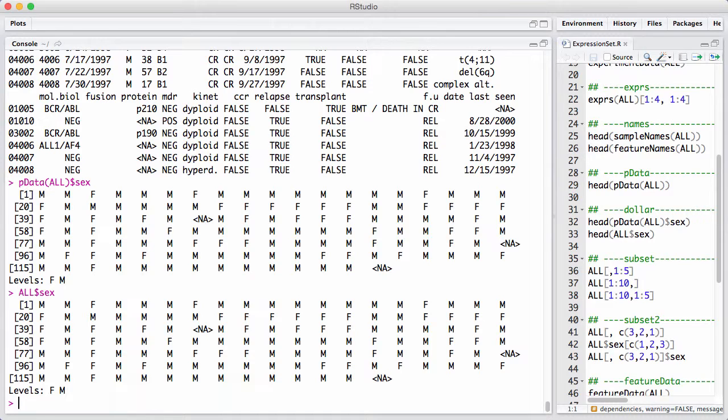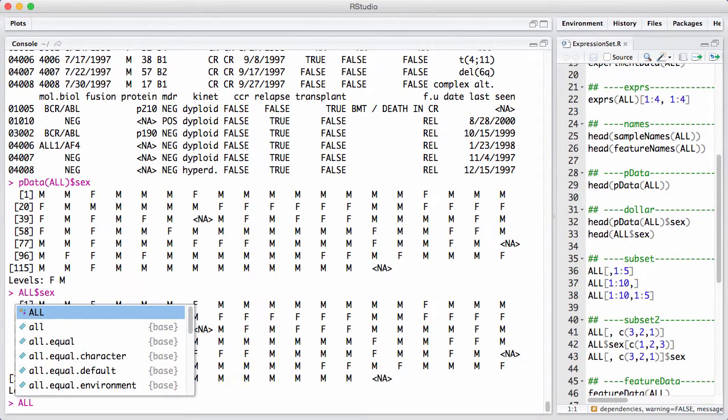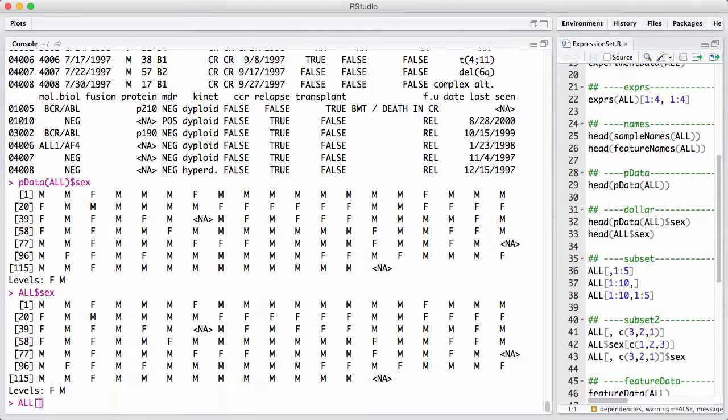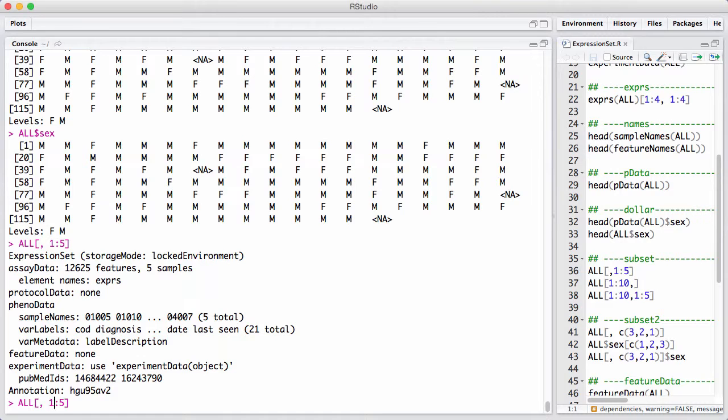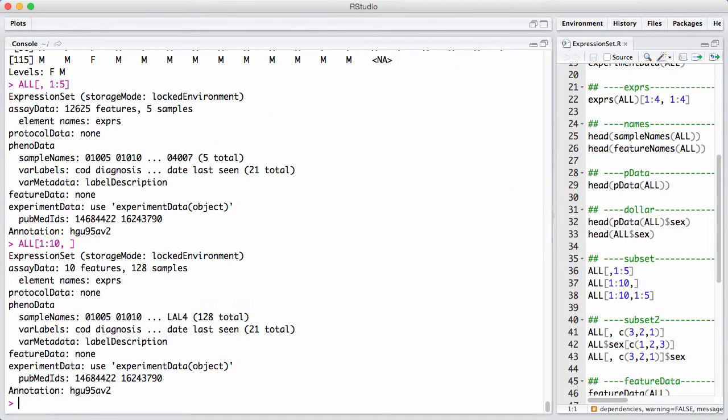An expression set satisfies two-dimensional subsetting. The first dimension gives you features and the second dimension gives you samples. So, this type of subsetting here, I'm selecting the first five samples. And you can see in the output that I get back all 12,000 genes, but only five samples. In the same way, I can ask for the first 10 features. And now I get back an expression set that has 10 features but keeps 128 samples.